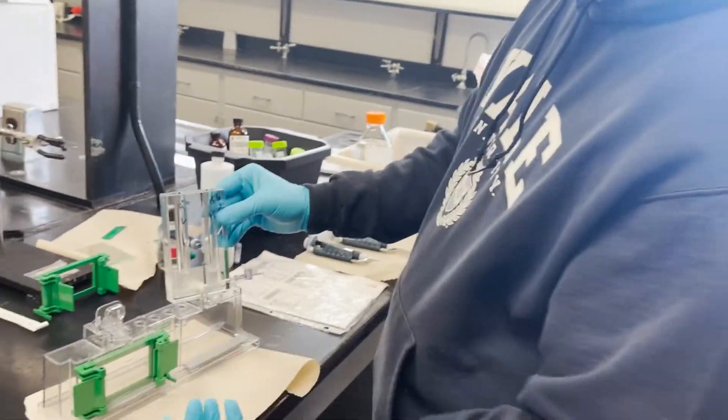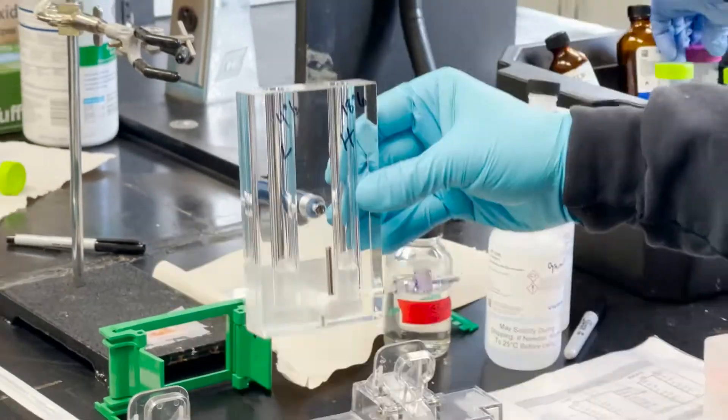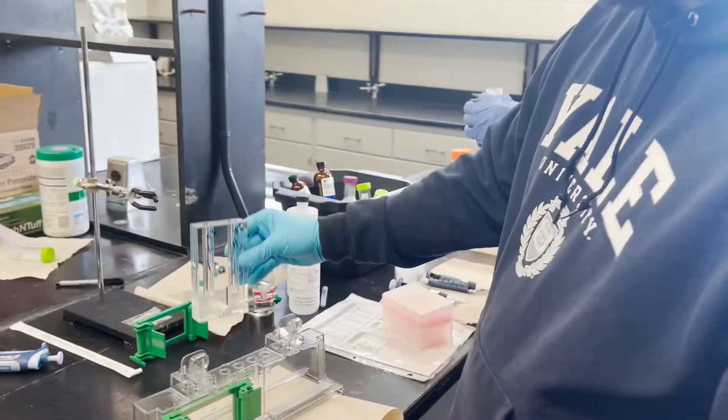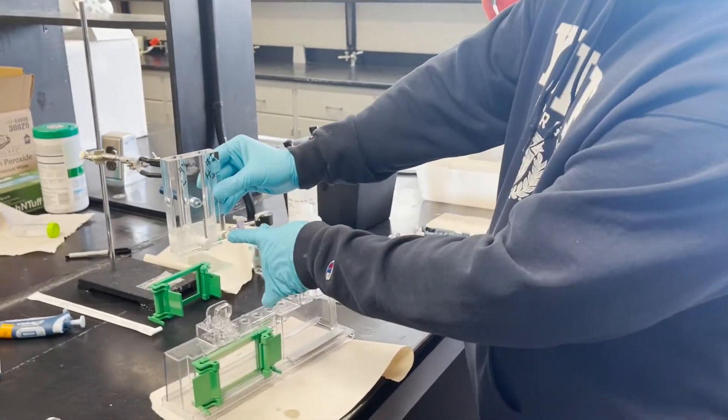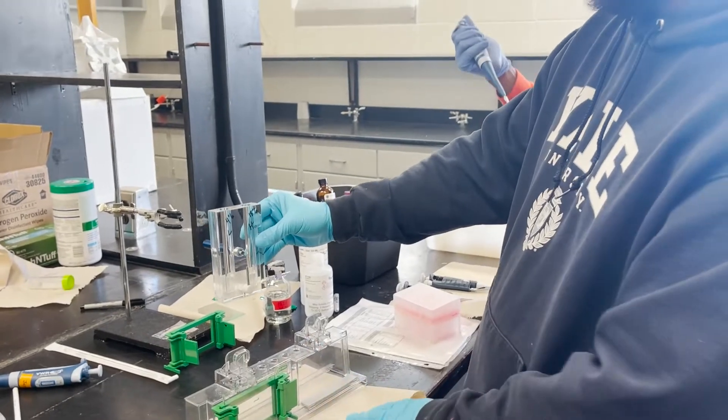As soon as the APS is added, it's going to start polymerizing and that's when I want to start mixing them. You can do this multiple ways — I've done it like this where you literally add the APS and pour it. I've also done it where there's a setup with a pump that pumps it out of a tube. That's the most convenient way, but I don't have a pump set up right now.